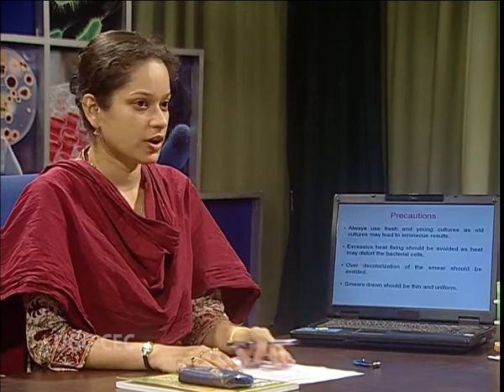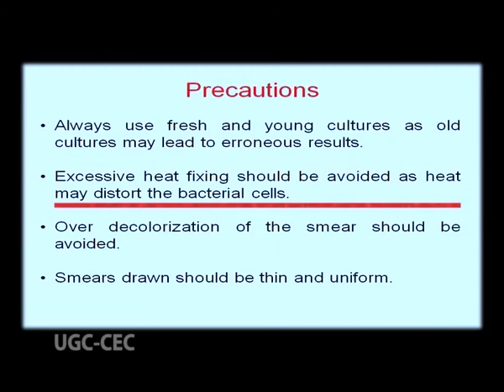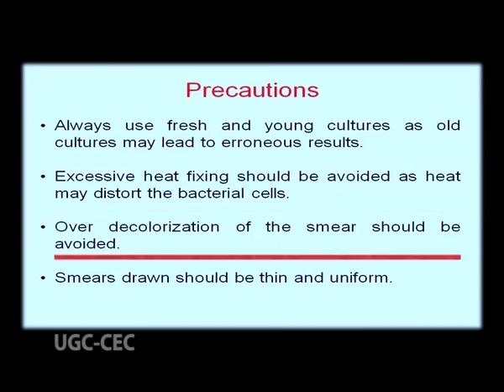Now, what are the precautions which we need to follow during the experimental procedure? The smear which is drawn should always be thin and uniform. During the heat fixation step, overheating of the smear should be avoided. The third point is over-decolorization of the smear should not be done. So, if we follow these precautions, then we will be able to get good results during the Gram staining method.